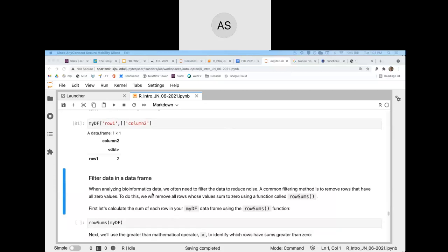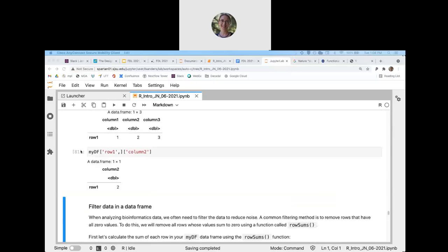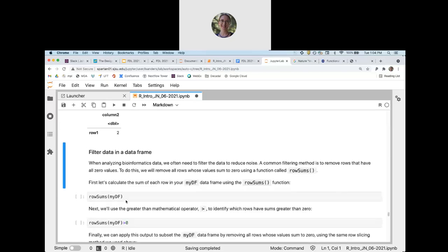All right, let's go ahead and get started. If anyone is not able to run the previous cell that we did before Steve's talk and get this output, please put it in the chat, because it might mean that you were disconnected from the VPN, and we have to go back and run some stuff. Okay, good. In that case, we're going to go ahead and move on to the next section.